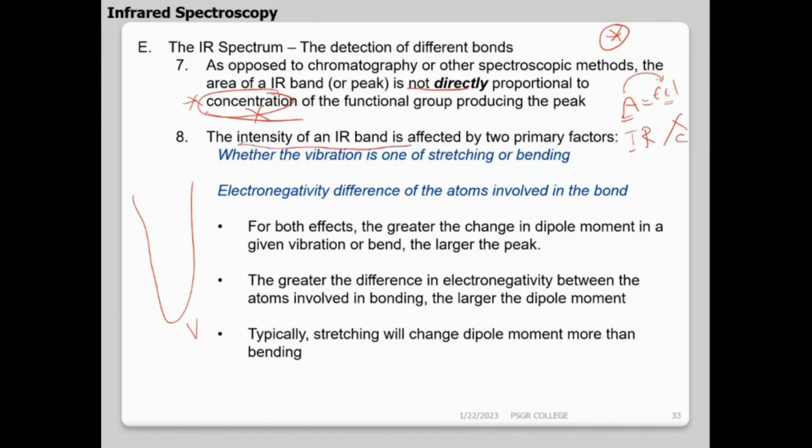So what is the intensity of an IR band? ஒரு band intensity அதிகமா இருக்குன்னா எதனால? Band intensity is high due to the change in dipole moment. Greater the change in dipole moment, greater will be the area under the peak. So strong band, weak band, medium band, how do I know? Guys tell me. How do I know?